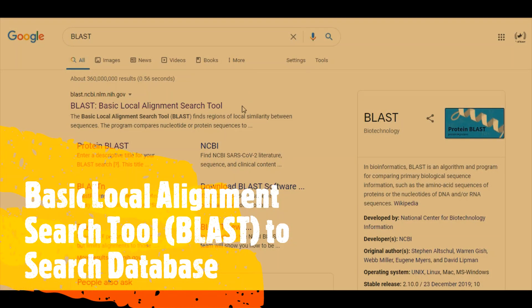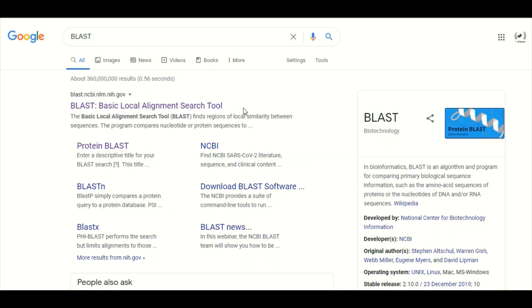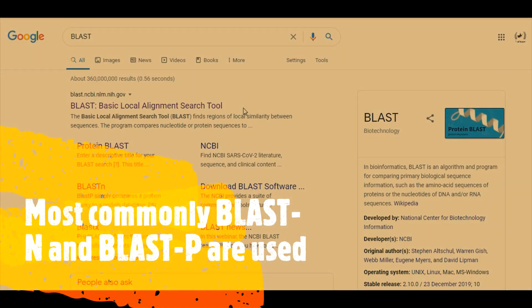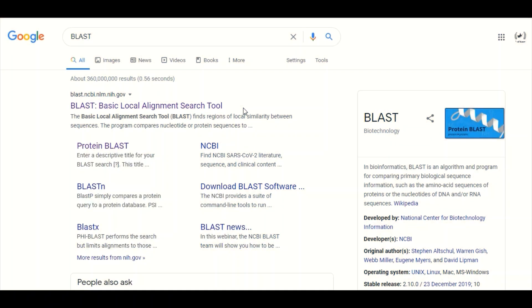In this tutorial we are going to talk about Basic Local Alignment Search Tool, which is commonly known as BLAST. There are different variants of the BLAST program including BLASTP, BLASTN, BLASTX, TBLASTN, and others. Most commonly BLASTP and BLASTN are used. BLASTP, also known as protein BLAST, is used to search protein databases, while BLASTN, also known as nucleotide BLAST, is used to search nucleotide databases.